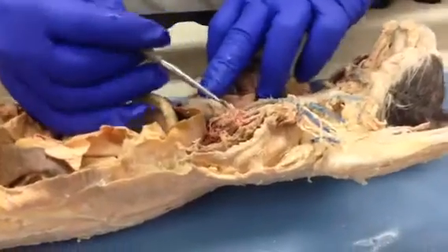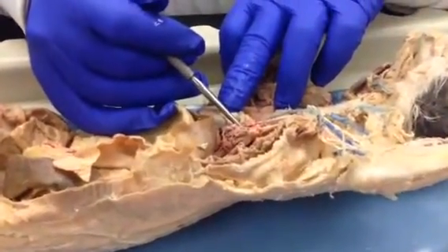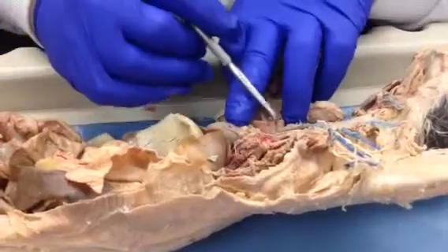Okay, but they've cut open the aortic arch. Somebody, I guess, thought the red was where they were going to. But there's the actual vessel with the red inside of it. Okay, they've cut it open. Just see what you're going to.